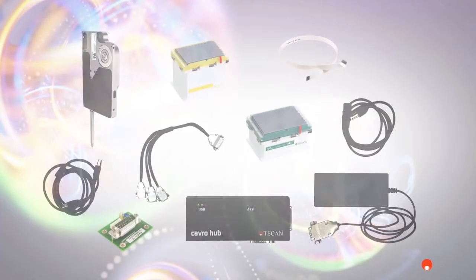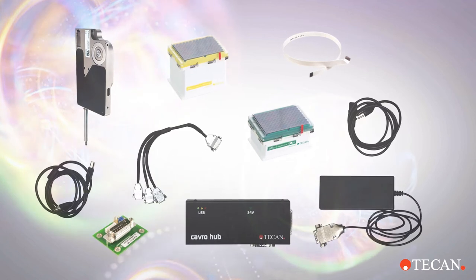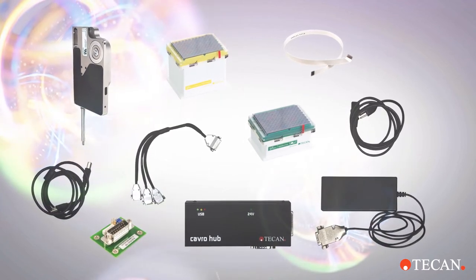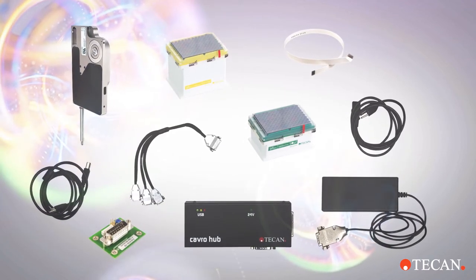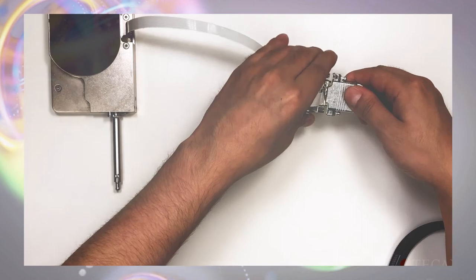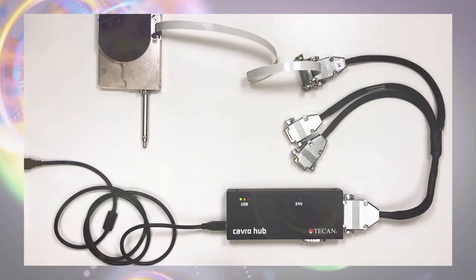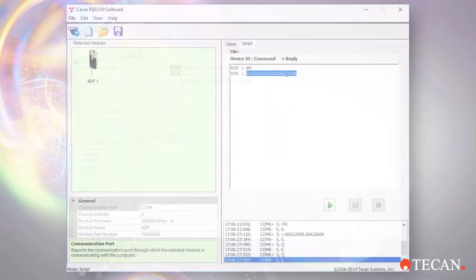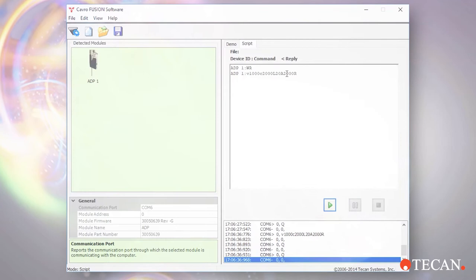In this instructional video, we are going to cover how to set up your CAVRO Air Displacement Pipetter Starter Kit. This includes setting up the ADP hardware, installing the CAVRO Fusion software, and connecting to your ADP.